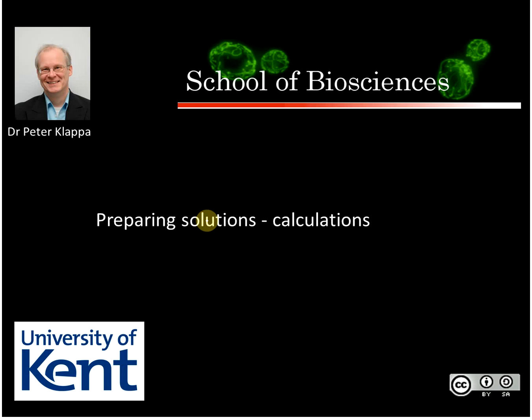And in this video clip I want to show you one of the biggest problems that people usually face when they work in a laboratory. It is about preparing solutions and how to do the calculations for that. And I will use the dimensional analysis method. This has the huge advantage that you don't have to learn any complicated equations or anything like that, so you just have to watch your units for this particular task.